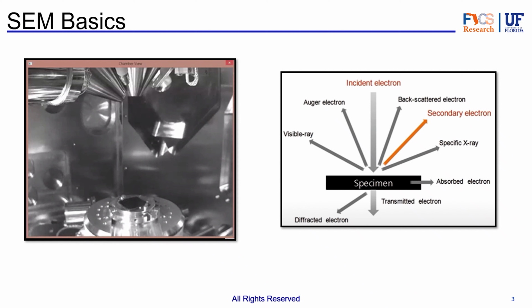Here we have an actual picture of the chamber of our SEM on campus. You have our sample down here, and then you have our beam gun up here. To our right, we have just pretty much a picture of what we see.